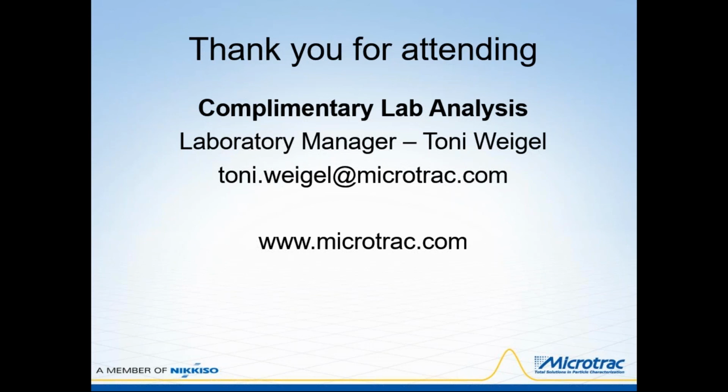Great, thank you. So Robert is asking, how does the PartAn 3D keep the particles separate and not clumped together during measurement? Does it use a fluidized bed or another method? The flow of the particles on the vibrator can be selected by the user, and the shaking on the vibrator deagglomerates most powders.